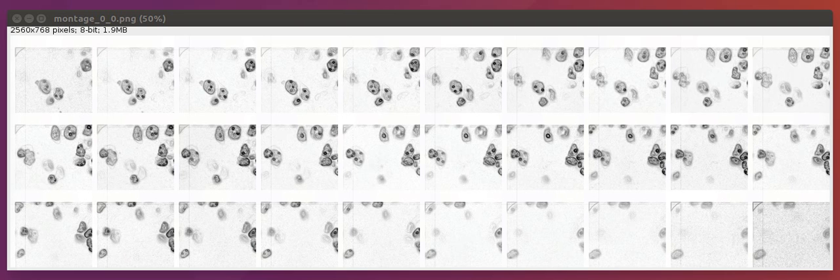At the middle of the object, we'd expect it to be its biggest and brightest, and then as we continue to move up, it would become smaller and dimmer again. Using this pattern, we can identify single cells, and that's what we can do here.